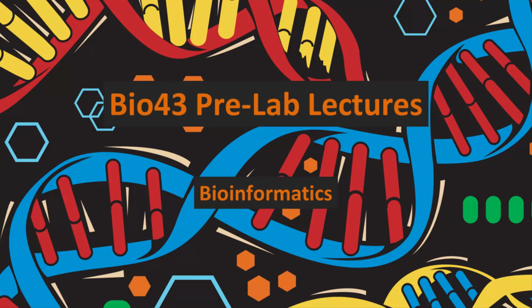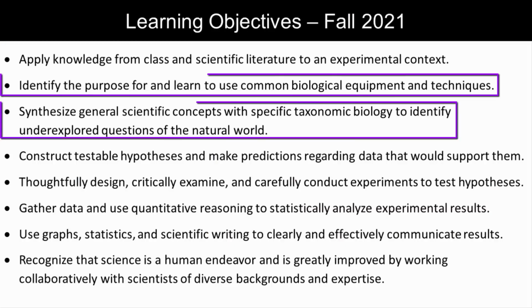This is a one-off lab on bioinformatics, but it links back to our first unit, where we studied Tetrahymena as a model organism. Tetrahymena makes a good model organism for cilia function because of the similarities in cilia structure. Now we're going to look for similarities on the genetic and protein levels. In doing so, you'll learn about the computational tools commonly used in molecular biology labs.